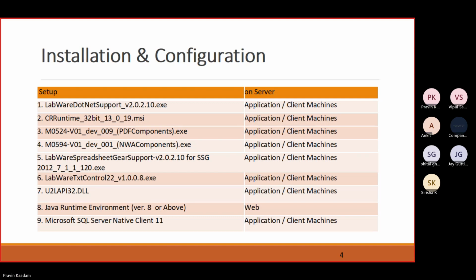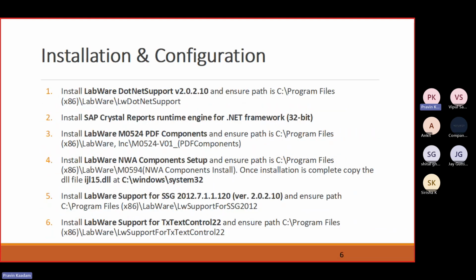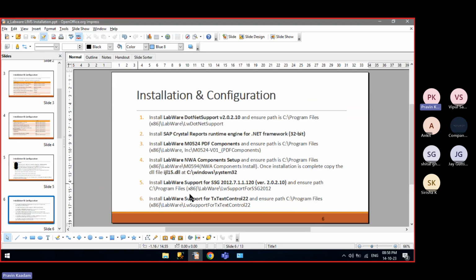Got it. Thank you, Praveen. So we have verified the prerequisite. Let us start with the installation. Installation is nothing but simple, step by step. We need to install the 9 setups which are provided.